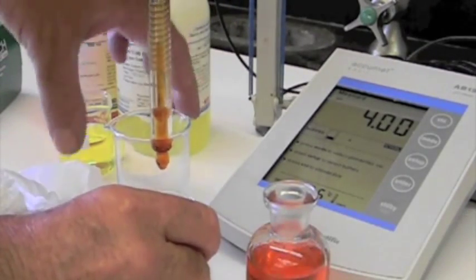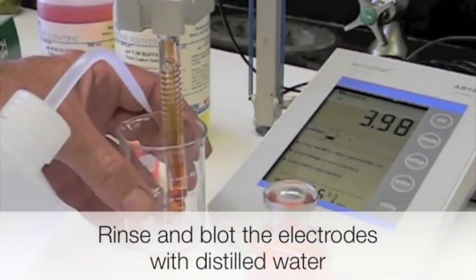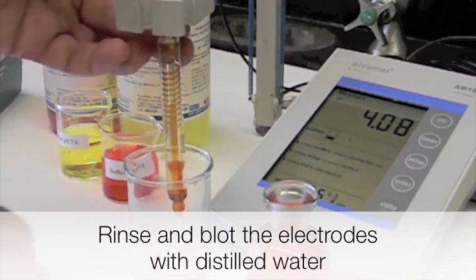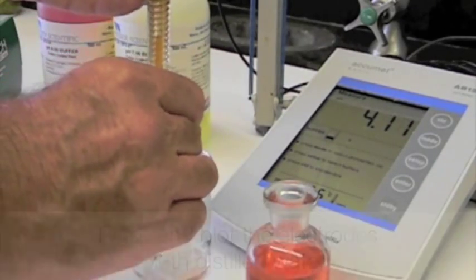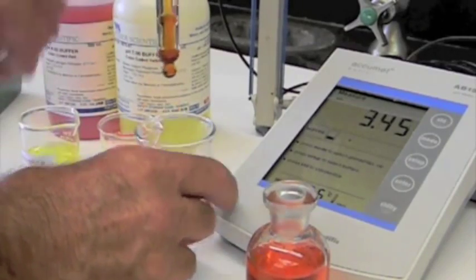Rinse and blot the electrode with distilled water. Immerse the electrode in pH 7 buffer solution and standardize.